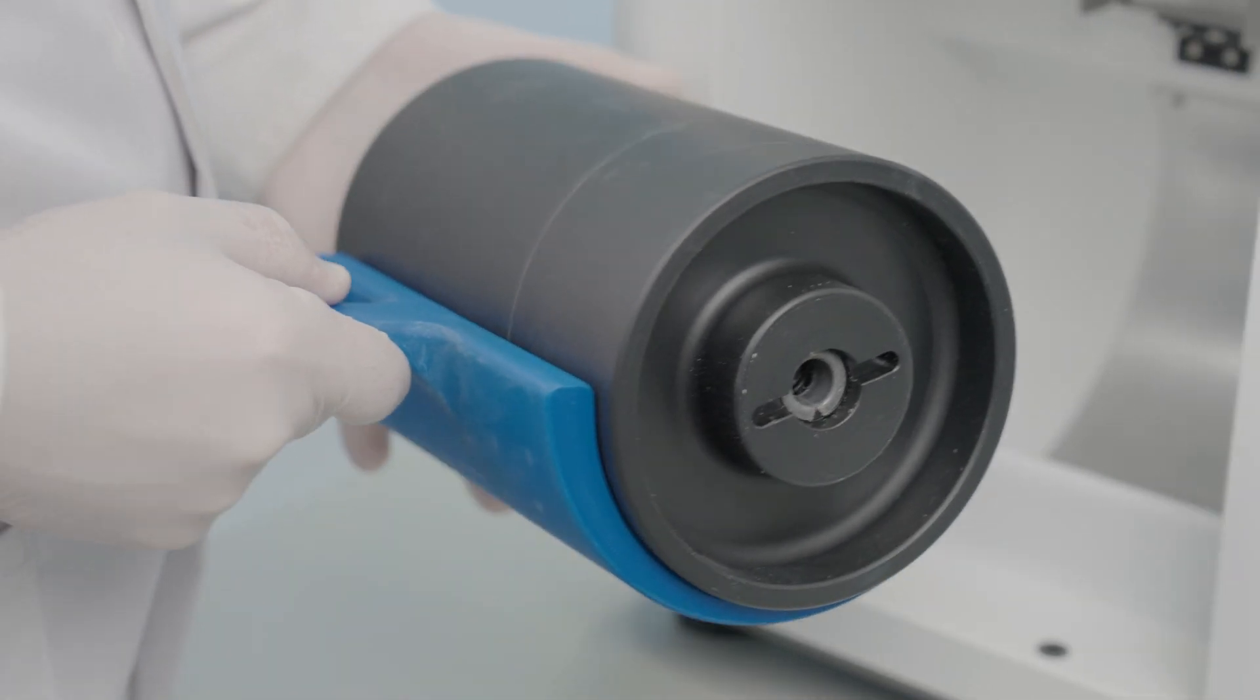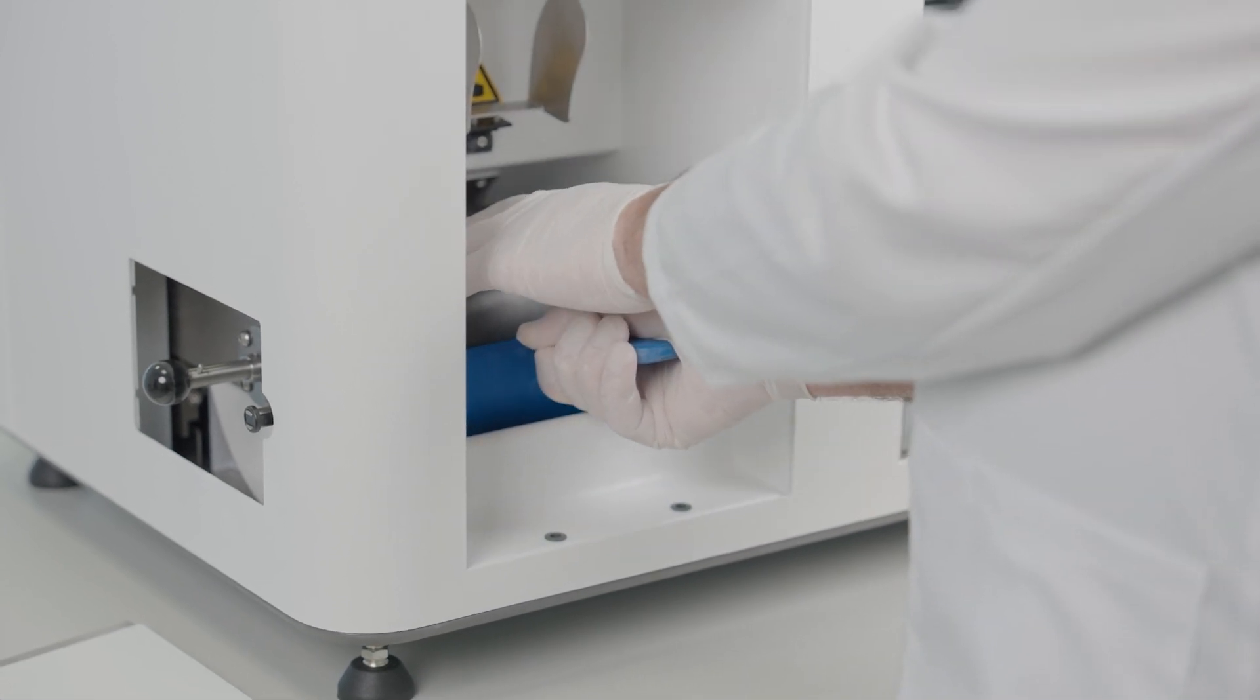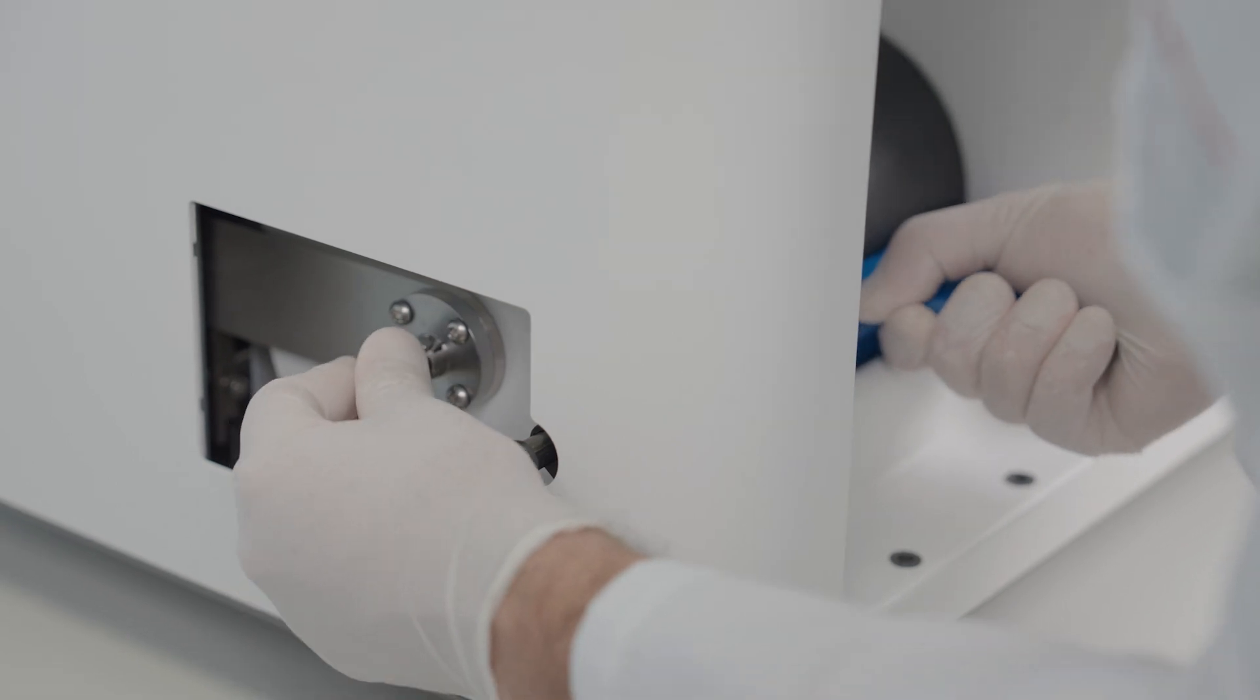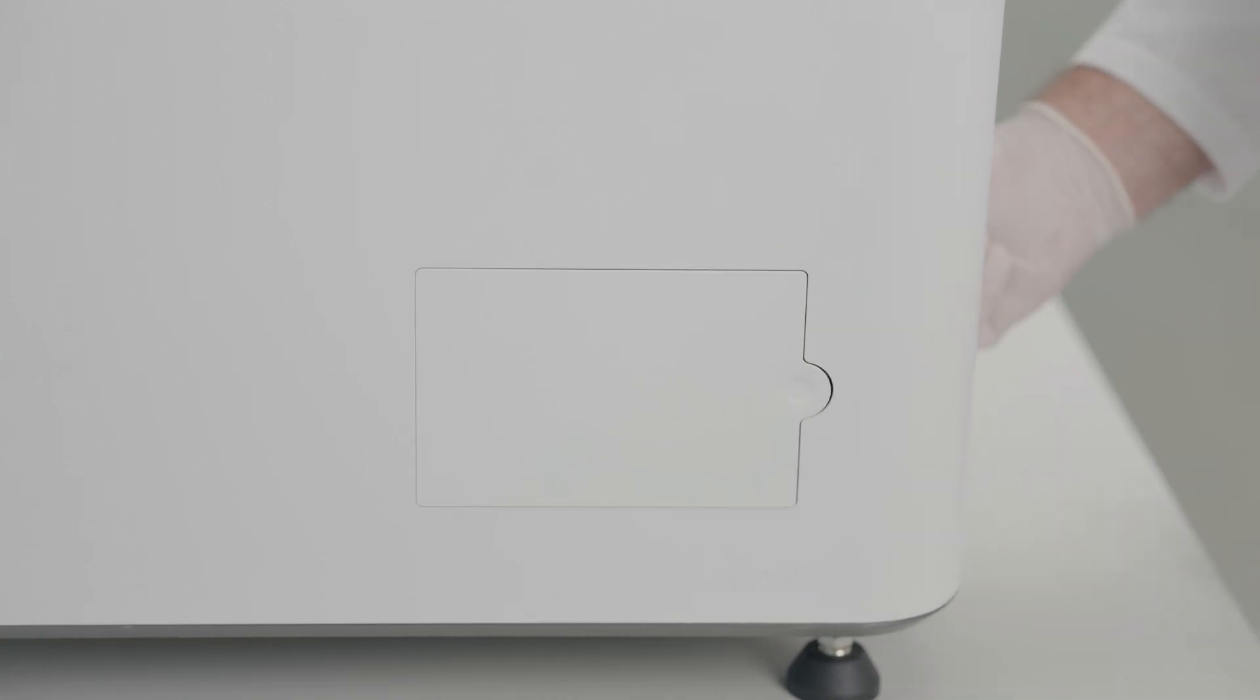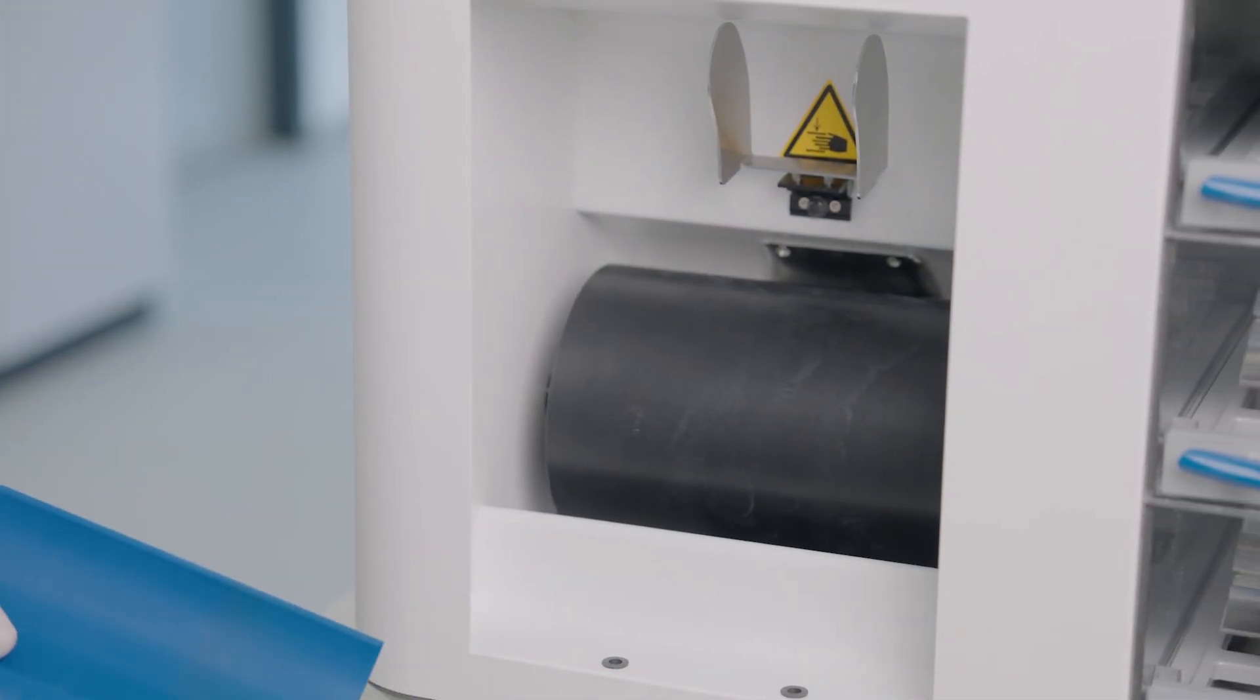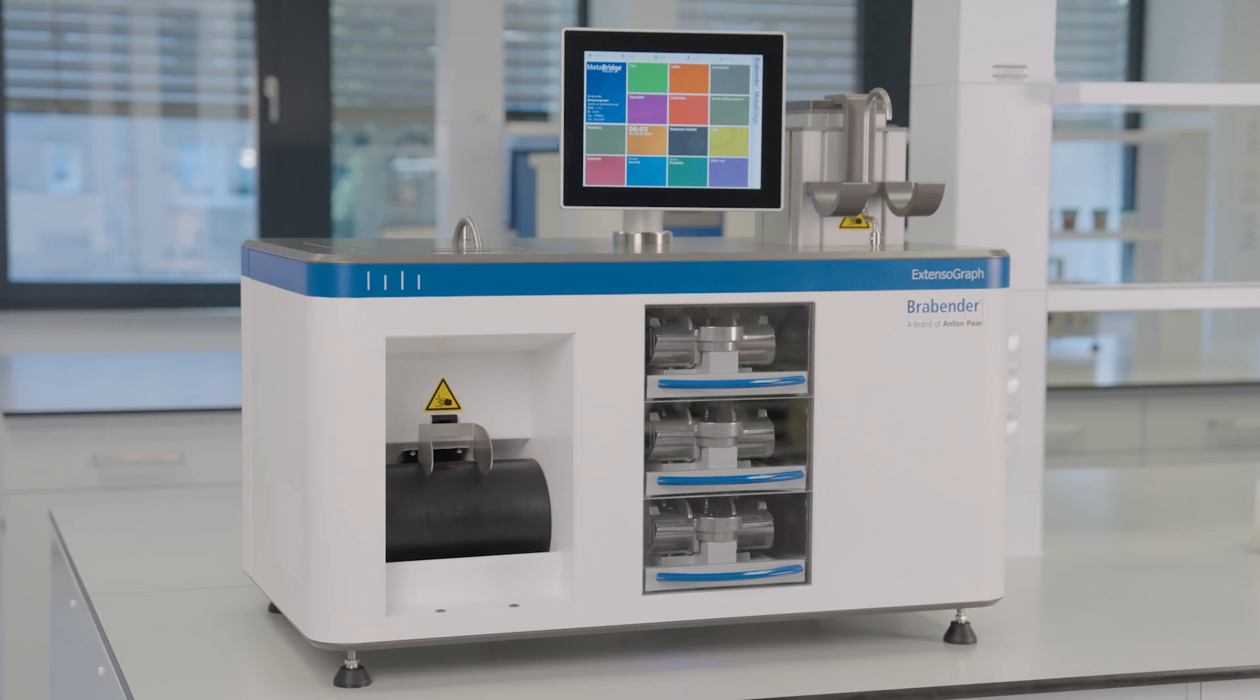Re-mount the dough roll. Insert and lock the maintenance flap. Remove the roll lifter. The extensograph is now ready for the next measurement.